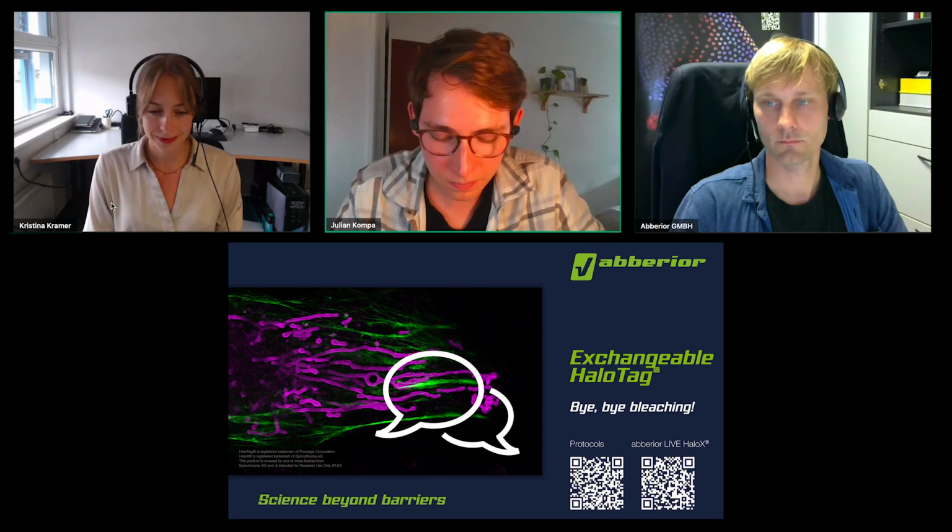Speaking about HaloTag for PAINT, overall I think that the beauty of self-labeling proteins is that we can use it for live cells, right? And this is something that so far was quite difficult for PAINT and MINFLUX because the acquisition times are very long. But there have been some recent studies that used deep learning algorithms in combination with the exchangeable HaloTag ligands to also do PAINT with a high temporal resolution in live cells. And this is where I see a bright future.